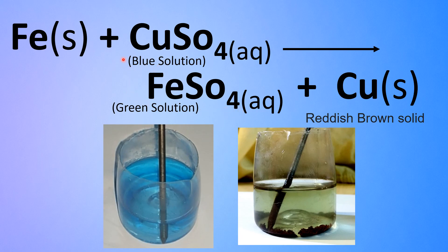And the copper, now that it is displaced, forms the reddish brown solid copper. Here, the blue solution is the copper sulphate solution and the green solution is the ferrous sulphate solution.